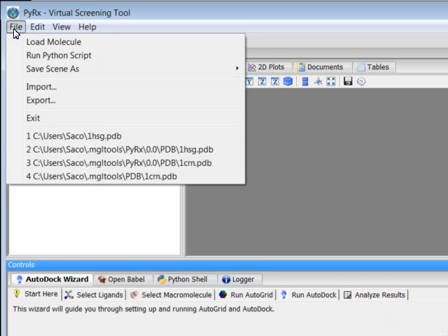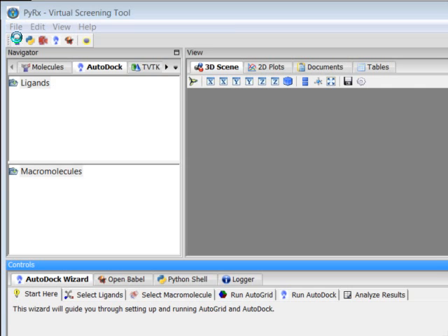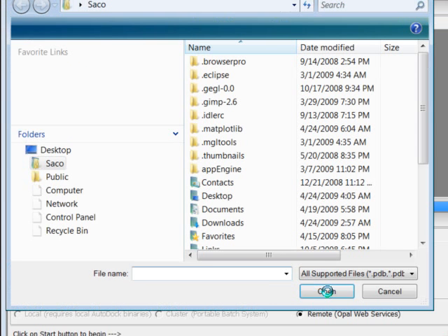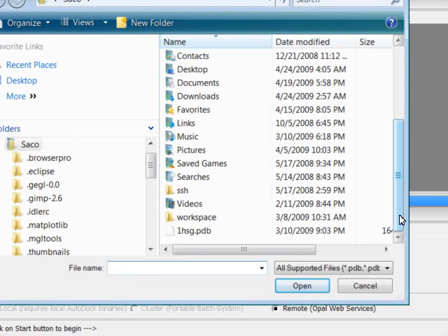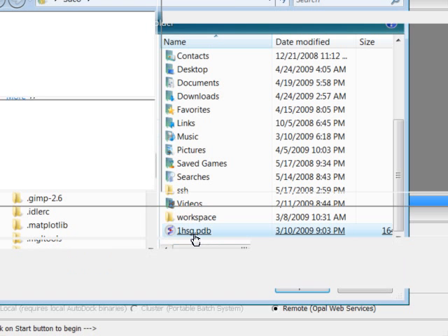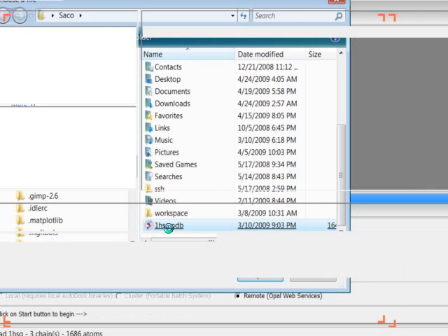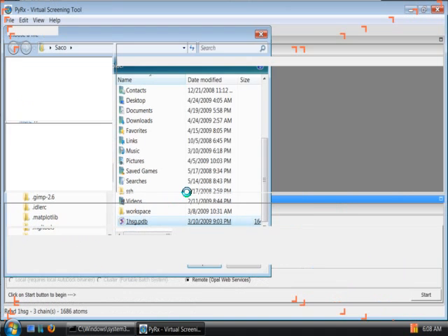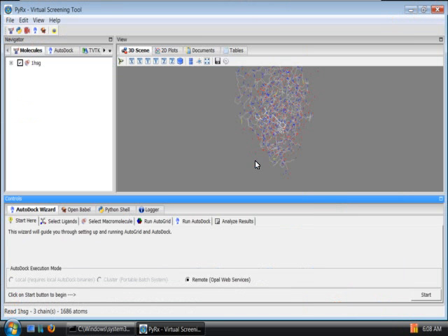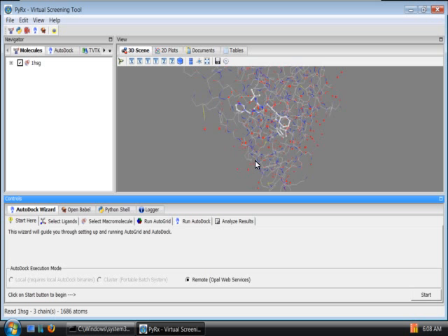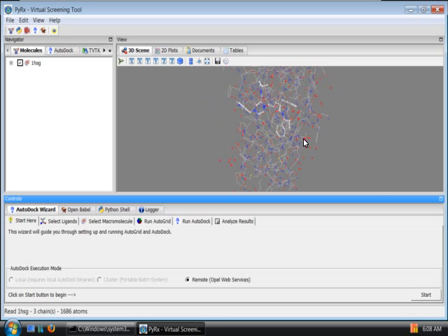Let's go to File, Load Molecule and I'll read one of the PDB files I have on my local hard drive called onehsg.pdb. I'll use my middle mouse button to zoom in.